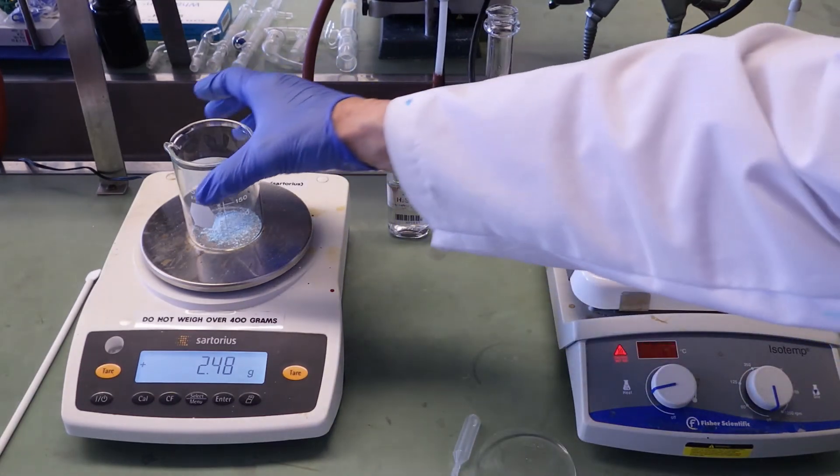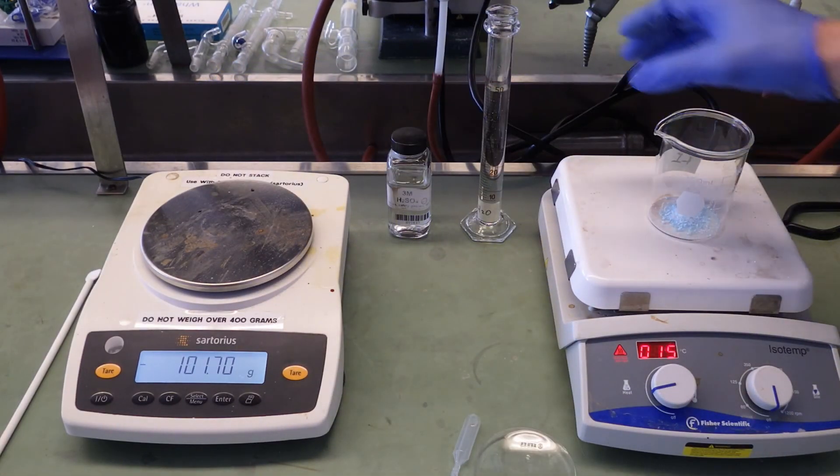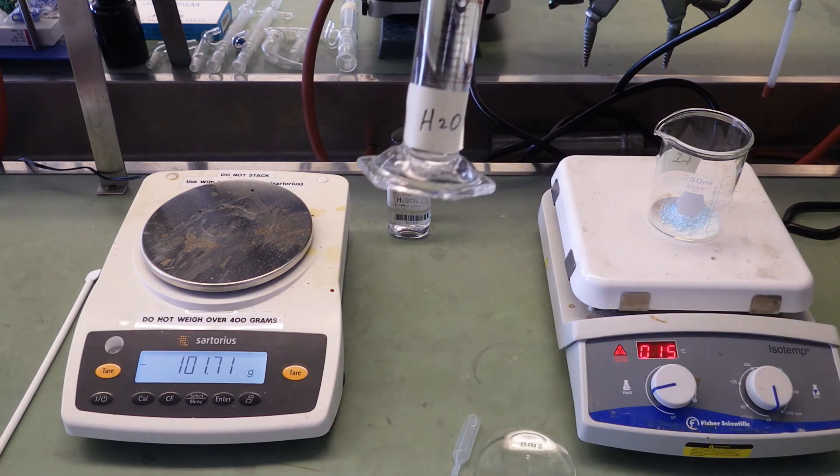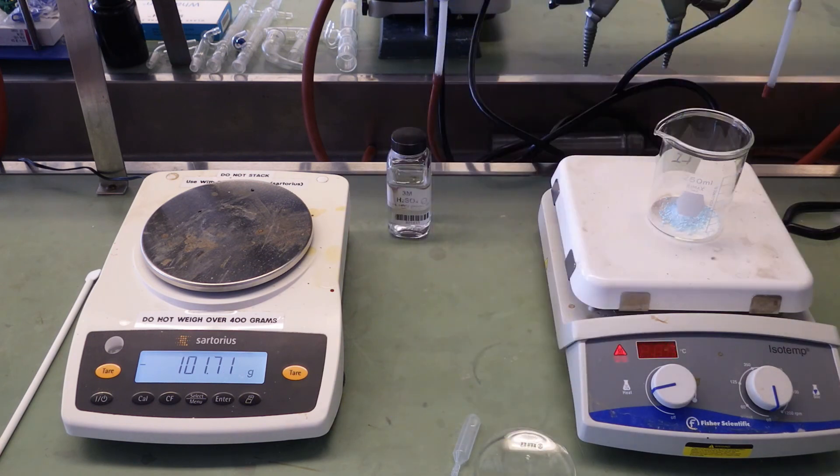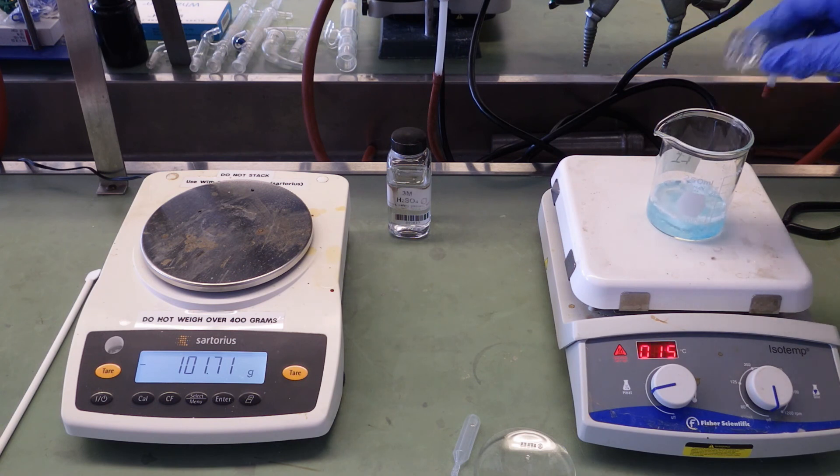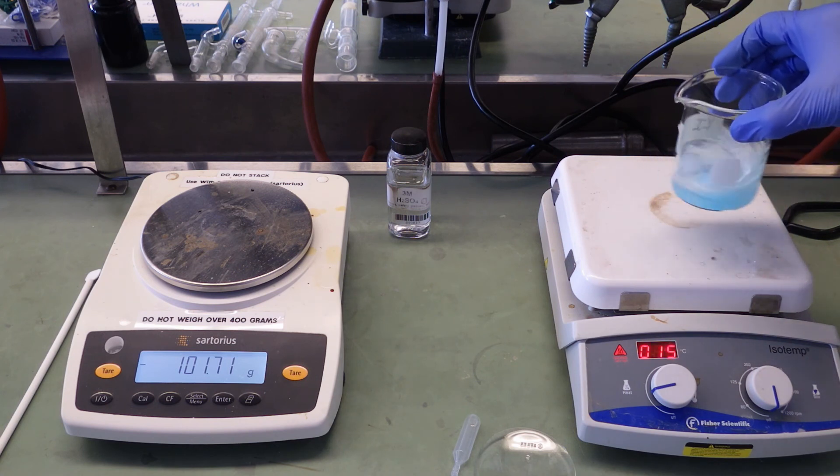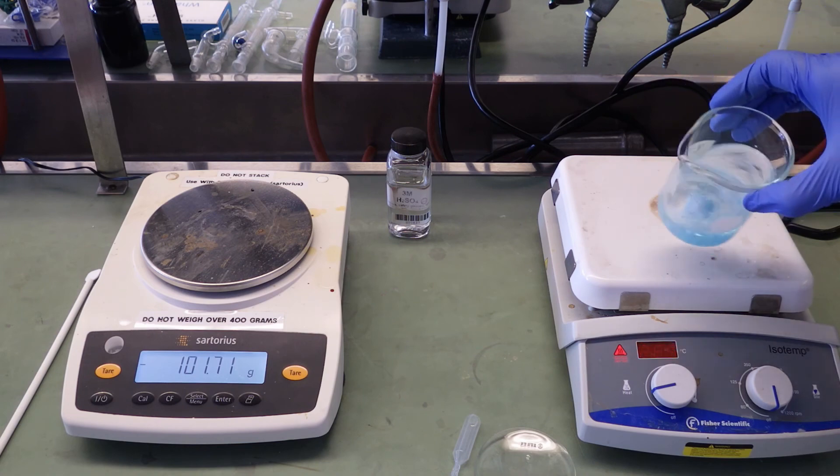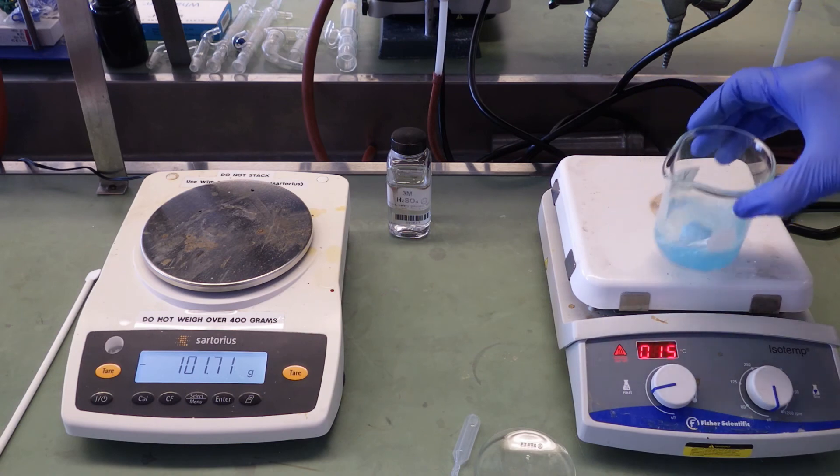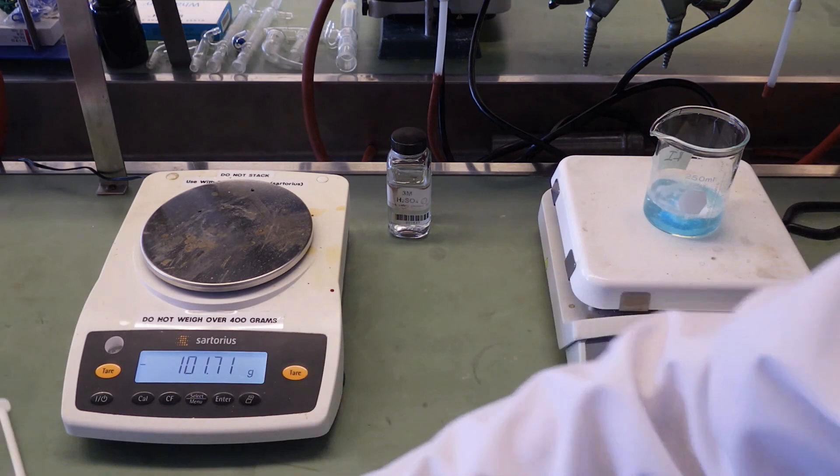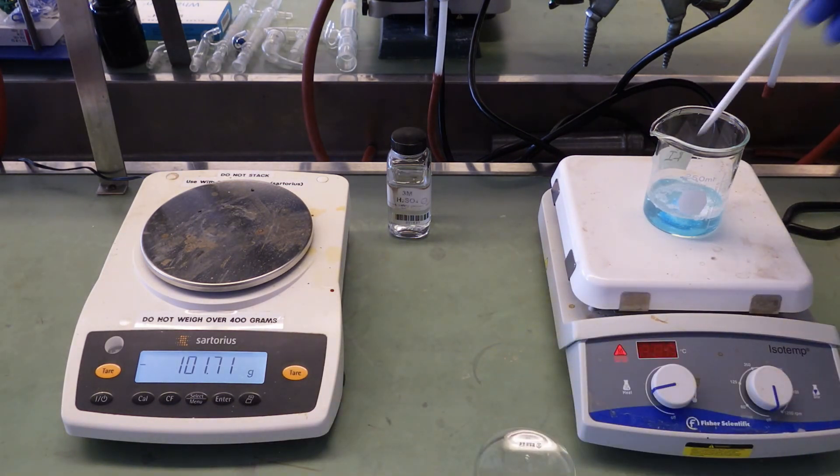Next we want to dissolve this. We'll use 50 milliliters of distilled water. Kind of chunky in the bottom in the center there. I'll break that up with a polypropylene stir rod.